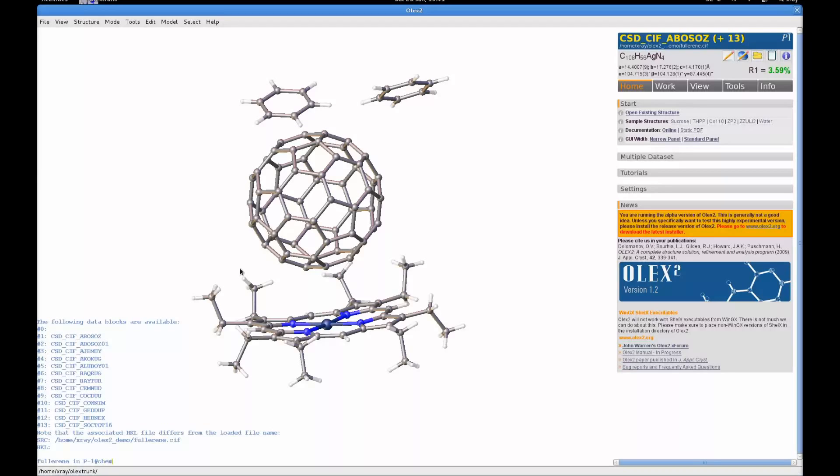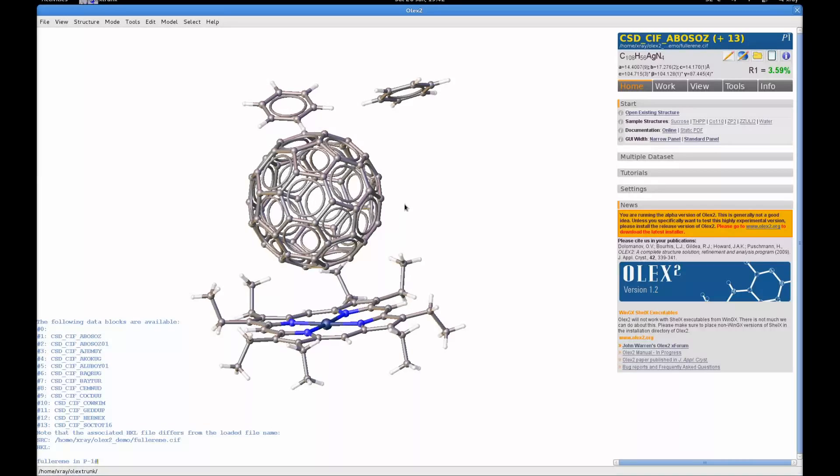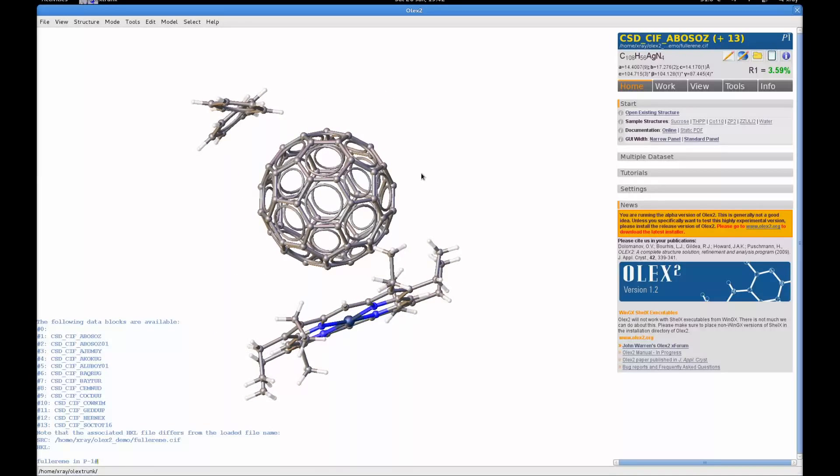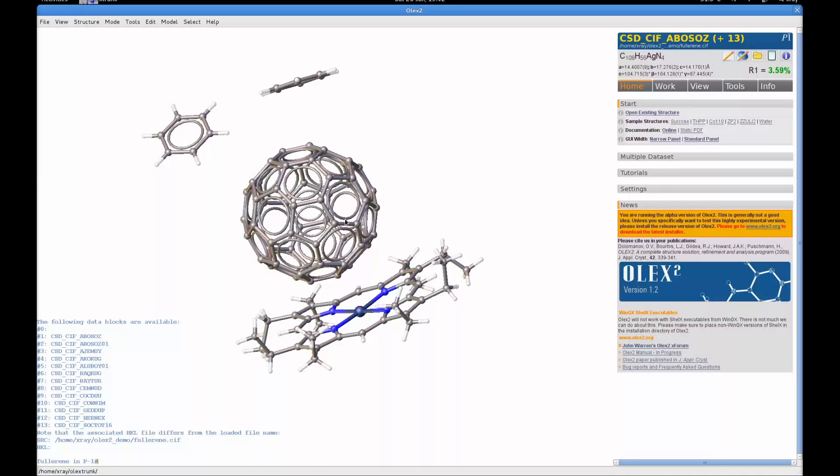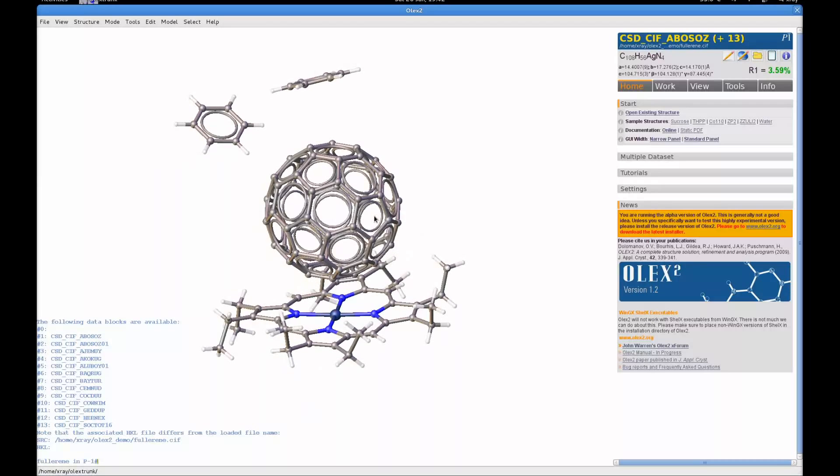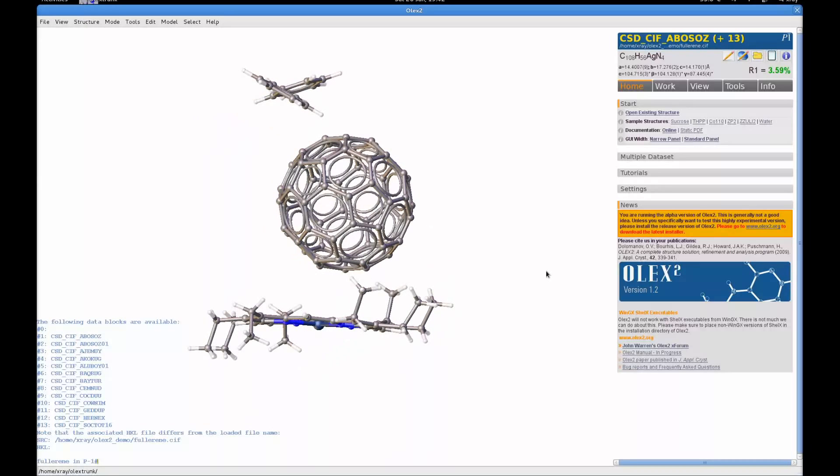And the command is chemdraw, which you can type in on the console line. And when you press return, OLX2 will put aromatic rings in every ring system that you think should be made aromatic. Which looks quite cool, especially when you look at the Buckminster Fullerene. I think that's quite a cool effect.